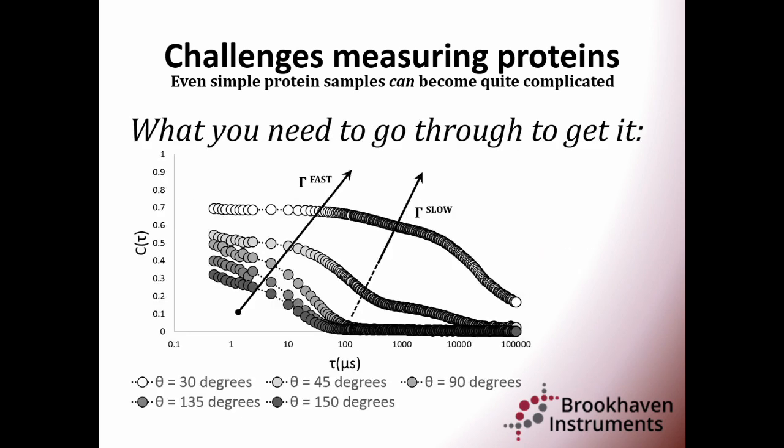Unfortunately, it's often more complicated than that. Don't worry, we're definitely going to come back to this, but what information do you really want to get out of this measurement? You want to know size, and you want to know if your protein is aggregated. And you have to dig through all this to get at it. Okay, so don't worry, we're going to come back to this. We're going to make sense out of this.